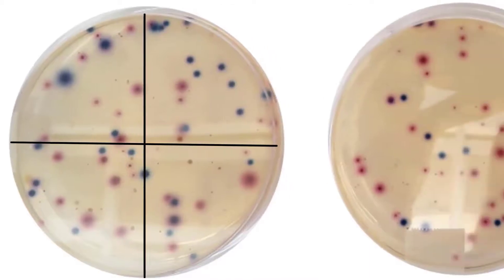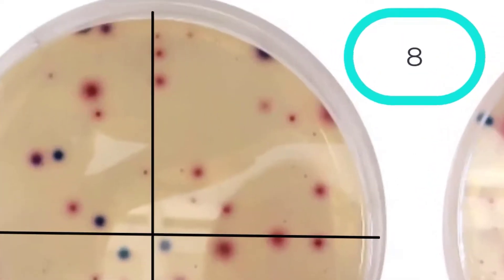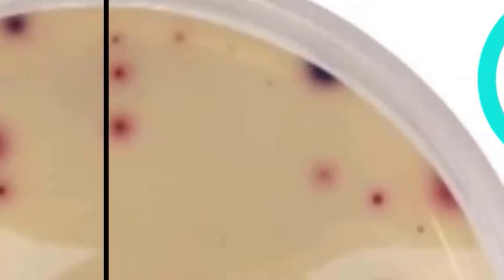Let's continue and count the other two plates. Looking at the top right quadrant of plate 2, let's count together: 1 through 8. There are 8 other coliform colonies in this quadrant. Before moving to the next quadrant, note the very small freckle-sized colonies scattered around — these are much smaller than the head of a ballpoint pen and are too small to include in our count.